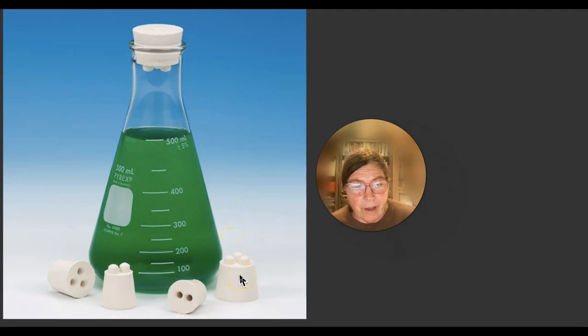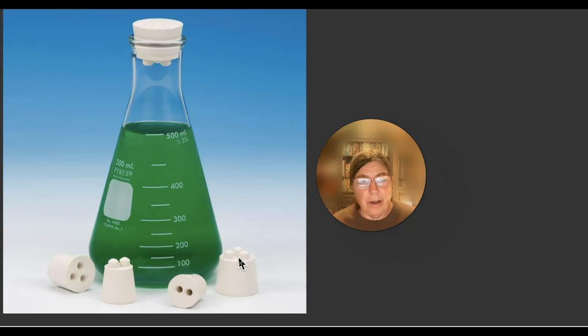You stopper the flask and connect it to the pressure gauge with these stoppers with holes in them. Now, these stoppers can be tricky because this one has 3 holes, and it came with these 3 little nubbins on the other side. But the nubbins are knocked off when you need them to connect plumbing. Here's the issue: sometimes the nubbins are knocked off and sometimes they're not. So sometimes you think you have a 2-hole stopper when you really have a 3-hole stopper, and vice versa.